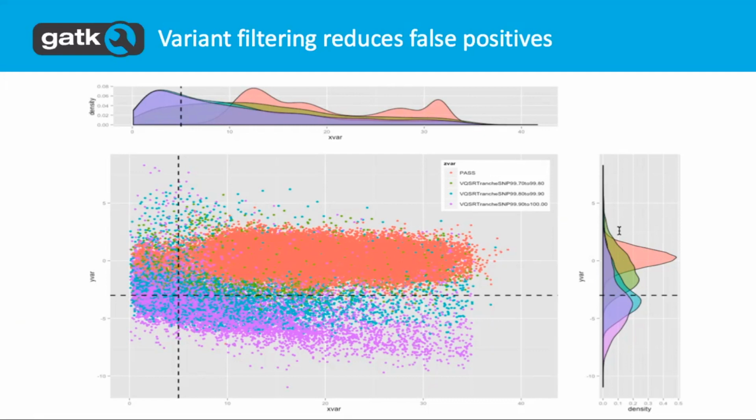The axes are two different annotations from the VCF. I don't know which ones, but in VQSR, for example, we use 7 of them, right? These are just two that give you a pretty-looking plot. Yeah, it's just an example to show the idea behind variant filtration.